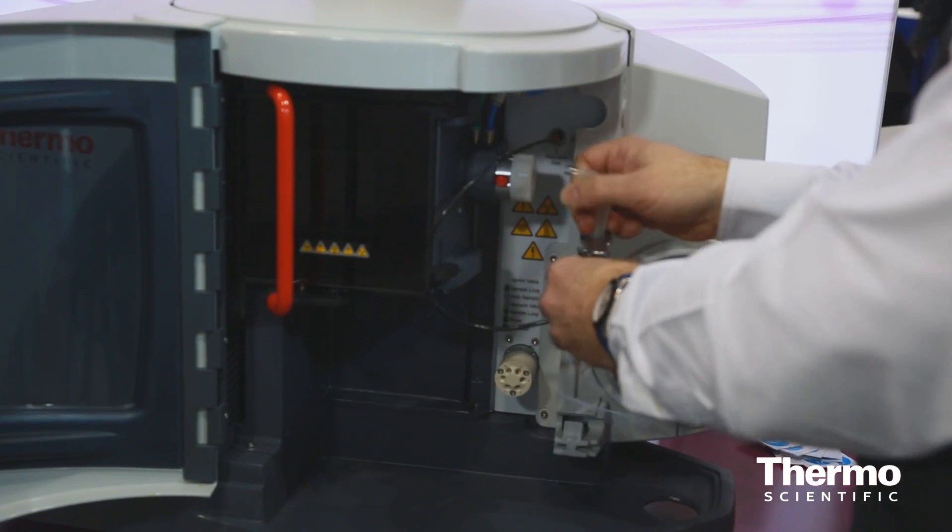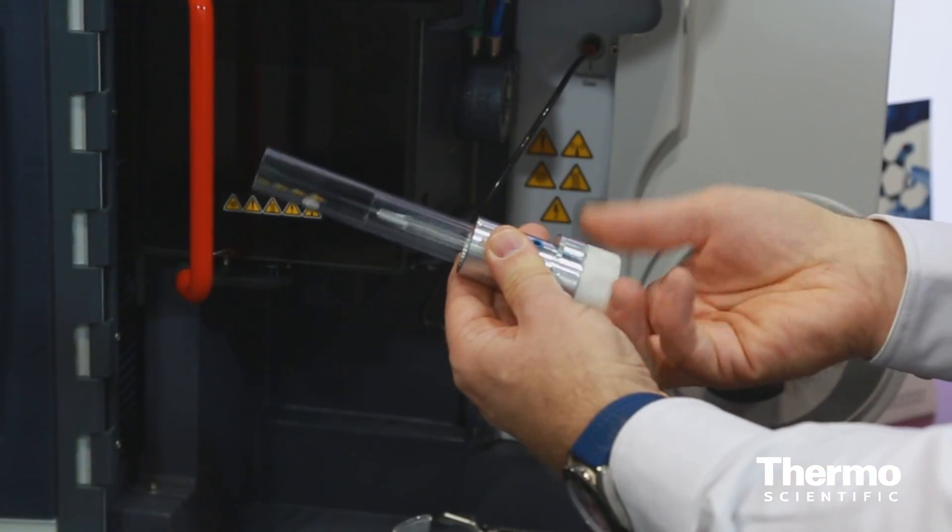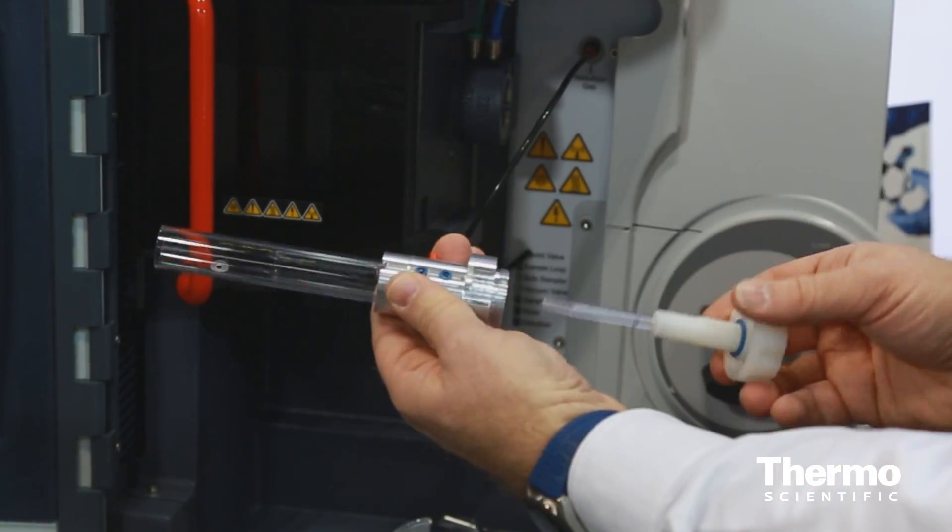Maintenance is often something that's raised when people are looking at getting a new instrument in their laboratory. They want something that's simple to clean, and the sample introduction system on this will come apart in just a couple of seconds — you really just need one hand to do it.